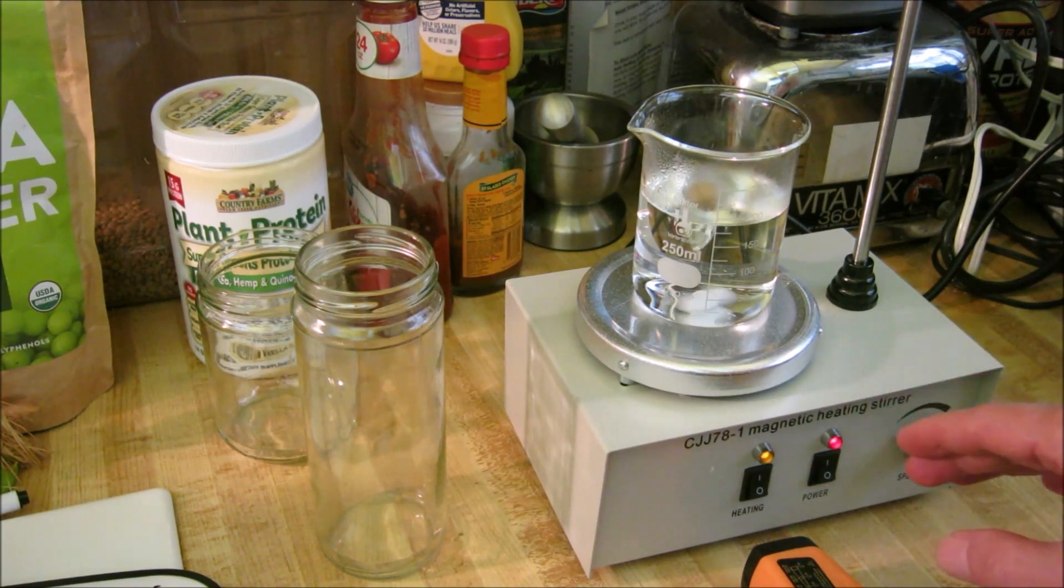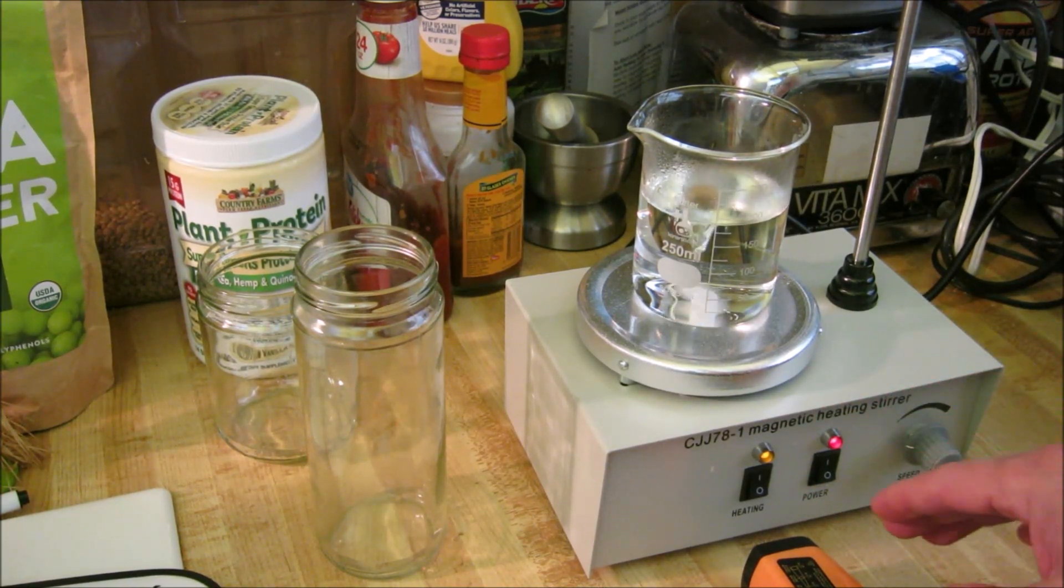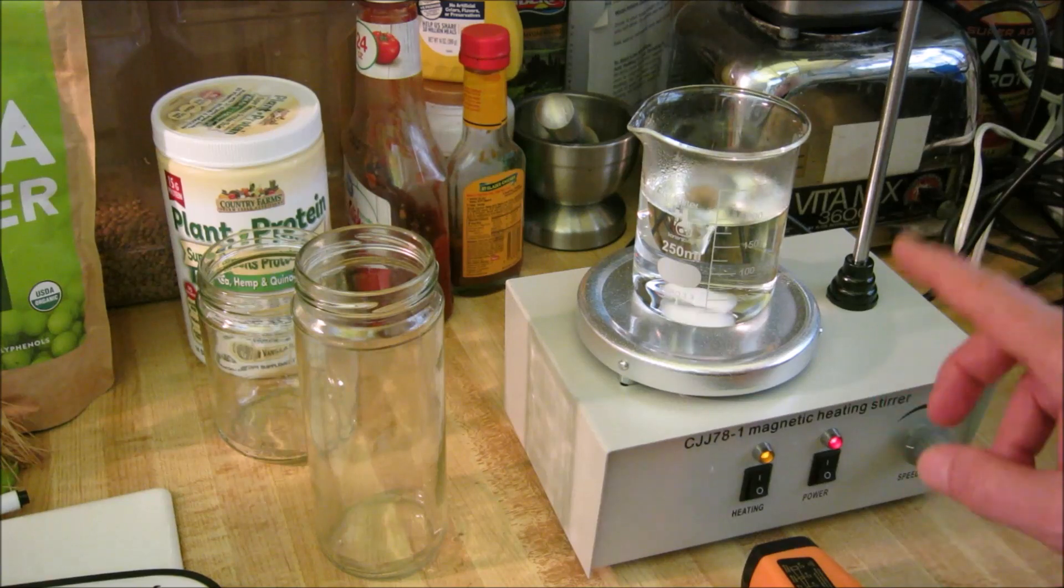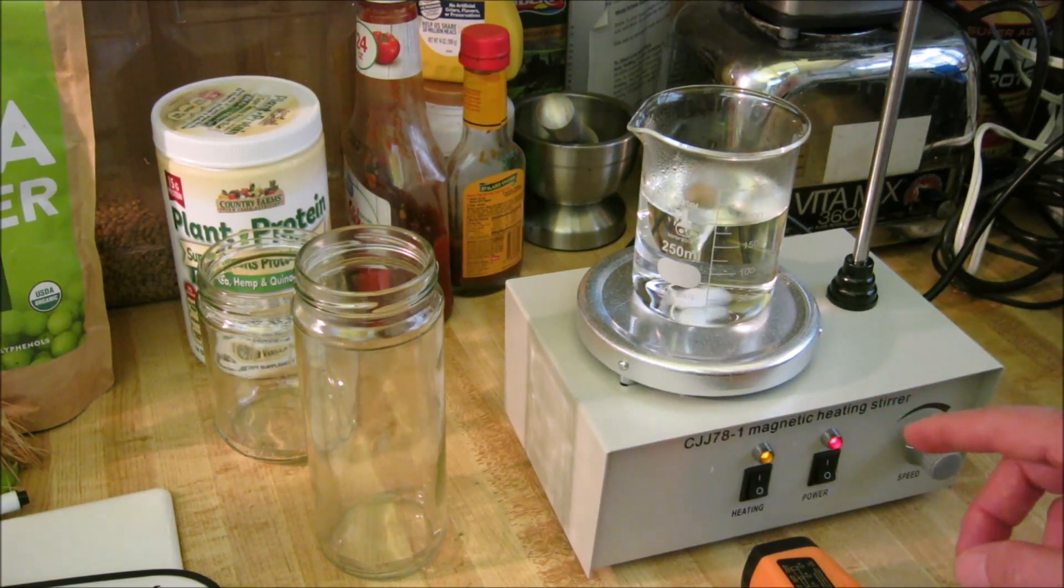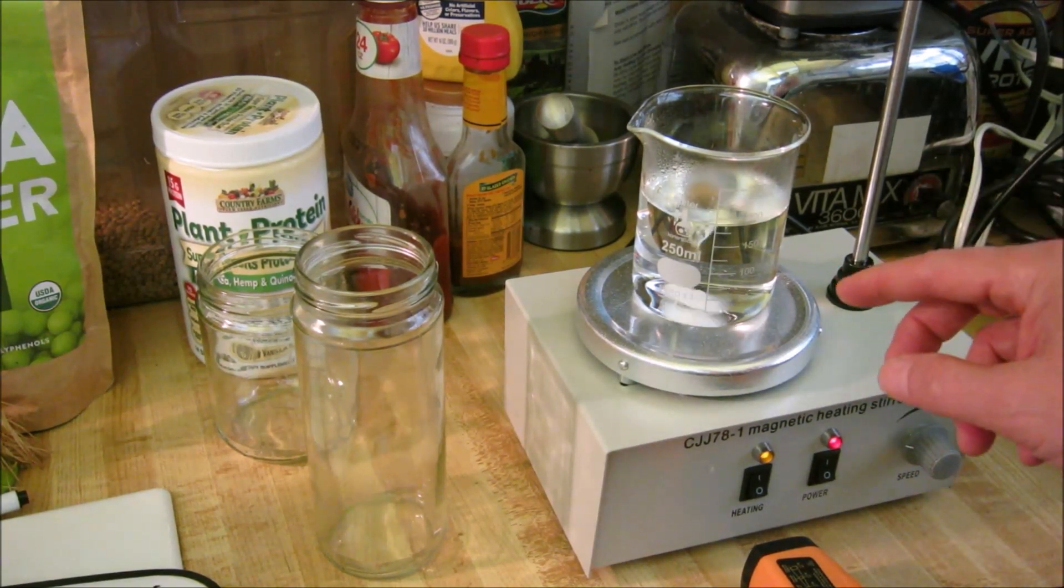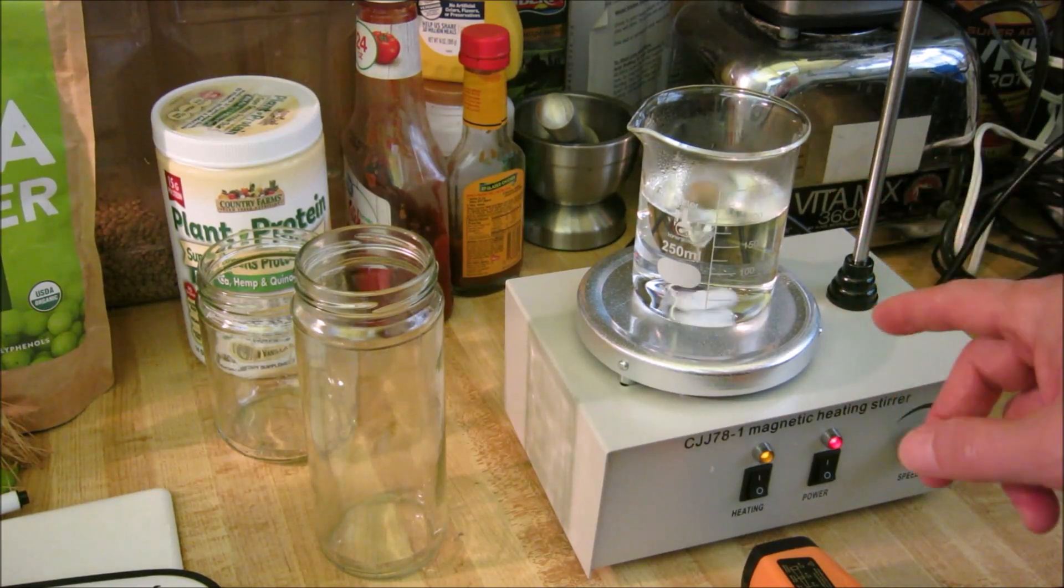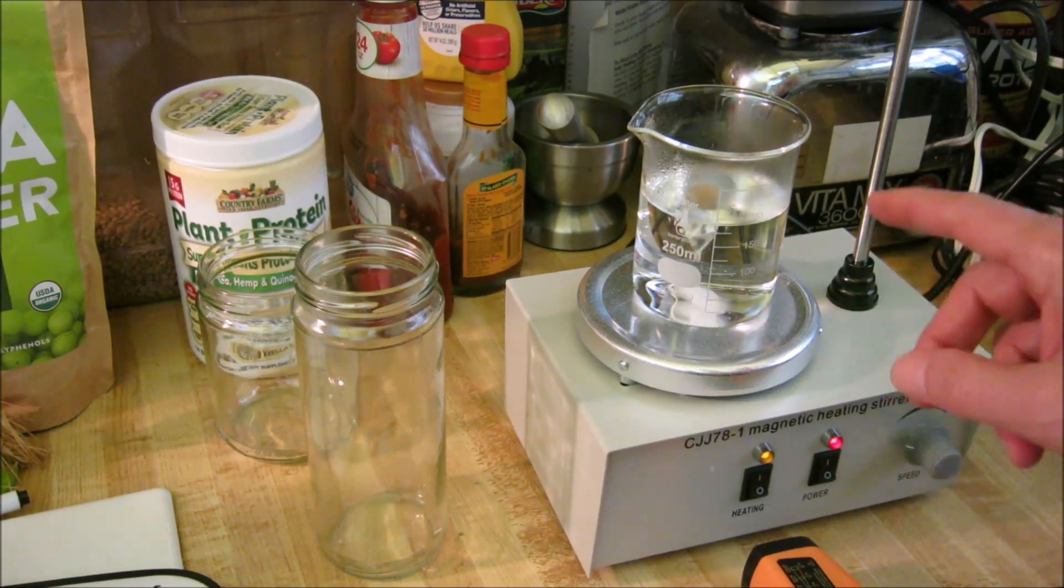It also takes a long time to get to a high temperature. It's a 110 volt device, 25 watts for the stir and 250 watts for the heating element.